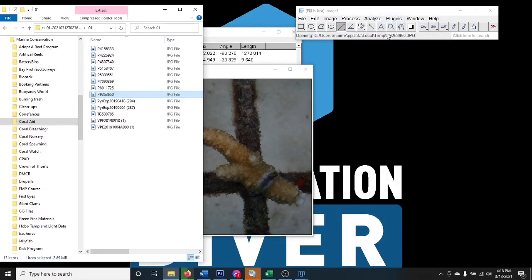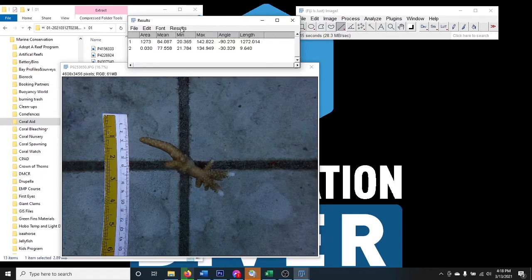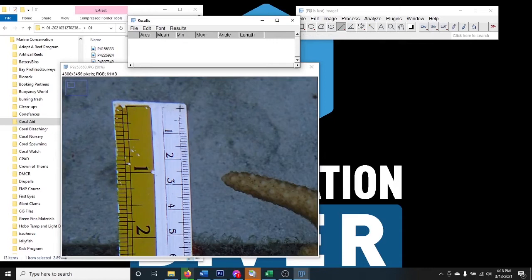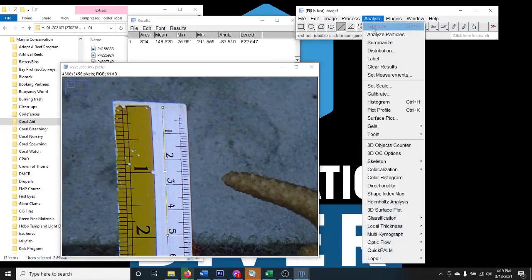I'll open a photo taken at a later date to show how I'd measure the same coral again. I'll drag and drop it in, then clear the results for clarity. I've got the same coral but it's grown a lot more. I'll zoom in a bit using Ctrl+Plus. Now set the scale again — note that zero on this ruler is not the edge, so come in a bit. I'll pull out five centimeters this time, then Ctrl+M to get the pixel distance.